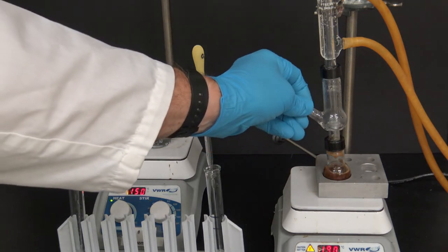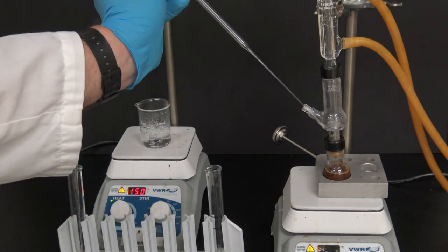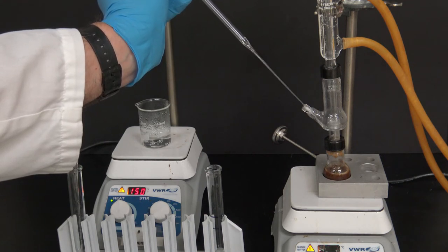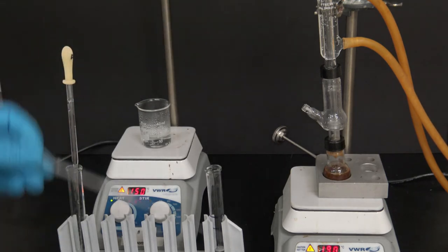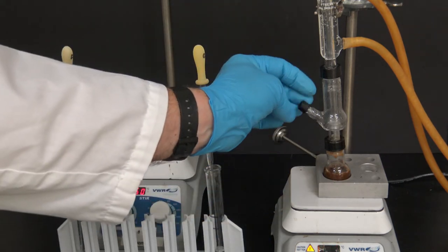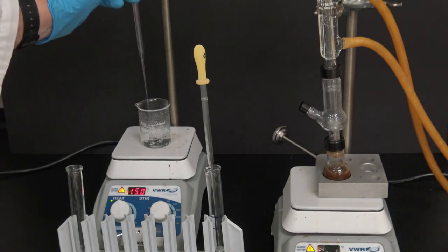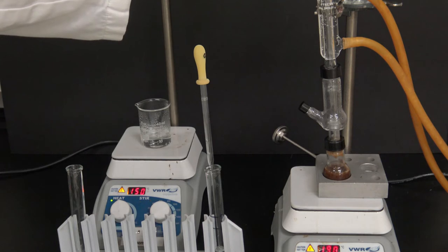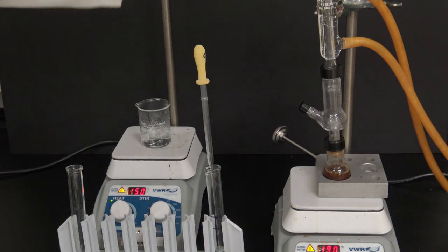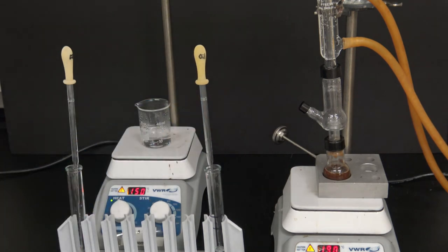I'm now going to remove some more of the distillate from my sidearm port here. And then replace a little bit of the water also. It's approximately the same amount. Right down the center. And then we'll continue to distill our material.